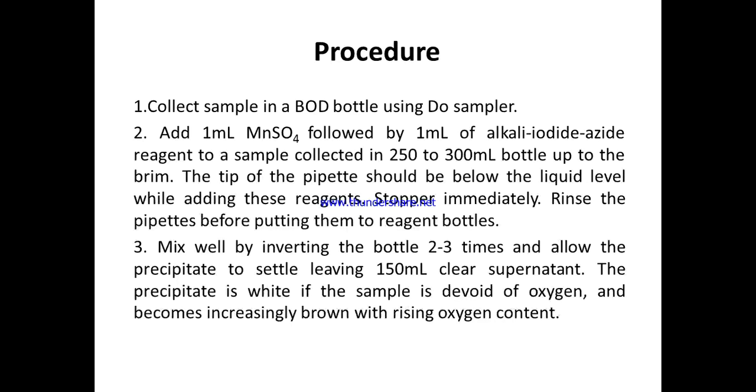So what did I tell you, we take a BOD bottle. Basically we take a BOD bottle, okay. We take the water sample, and we dilute it up to say 300 ml because the capacity of the BOD bottle is 300 milliliter.